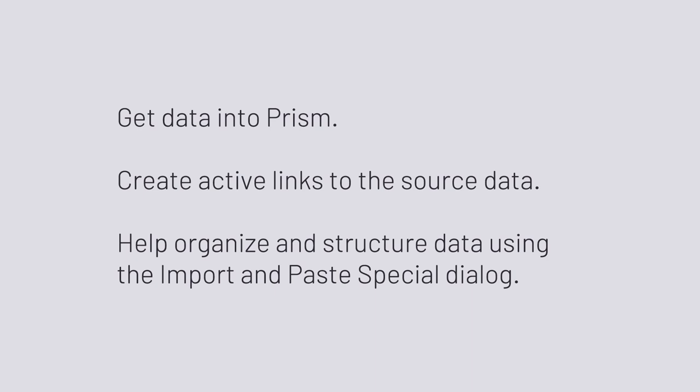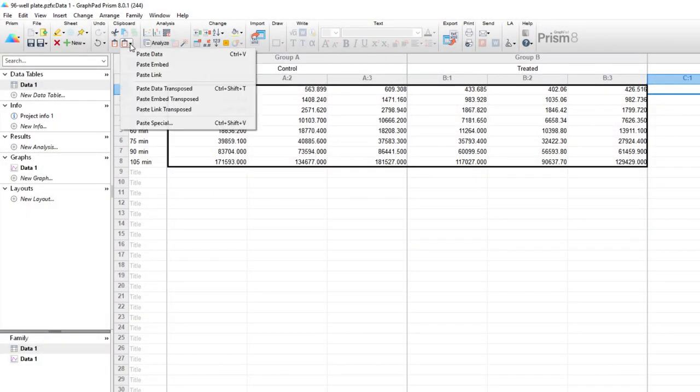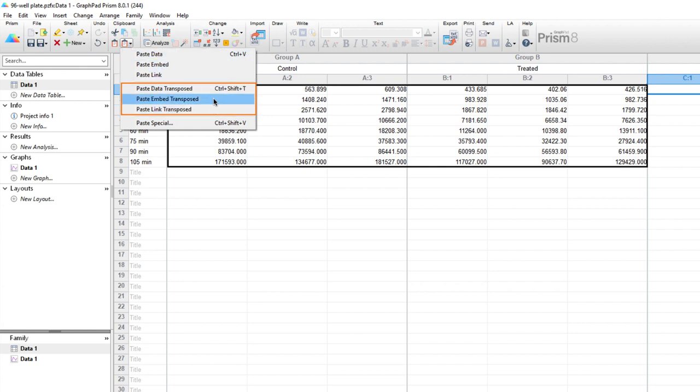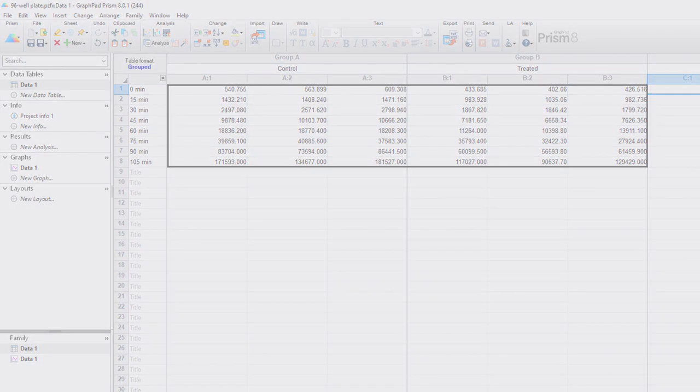So those are a lot of the features designed to help you get your data into Prism, create active links to the source data, and help organize and structure your data using the import and paste special dialog. There are additional features in Prism for handling and arranging data, such as paste transpose, in which rows of copied data become columns and columns become rows. This can be combined with paste link and paste embed to achieve a wide range of possibilities. Knowing how to utilize each of these tools we discussed today will help you get your data into Prism and get it organized more efficiently, reducing the amount of time it takes to analyze the most important part of your research, your data. Thank you.